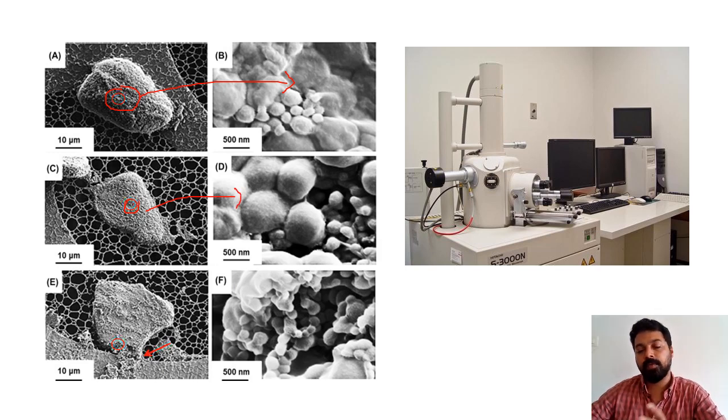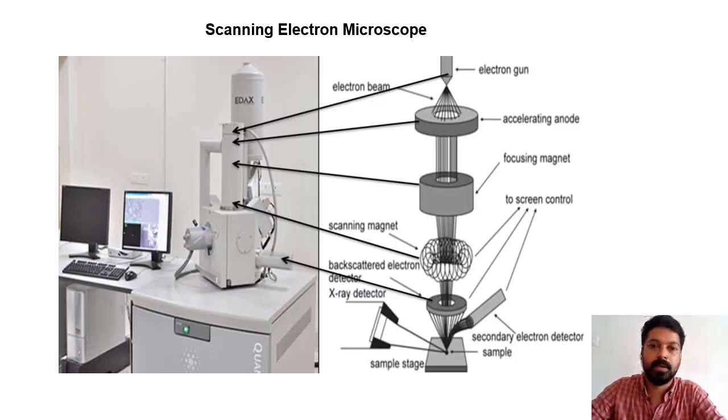When you use SEM or TEM, any electron microscope, the resolution and magnification increase. Resolution is the clarity, I can say. In terms of clarity, the clarity will be increased, or you can take the pictures in more depth. So let us see how.